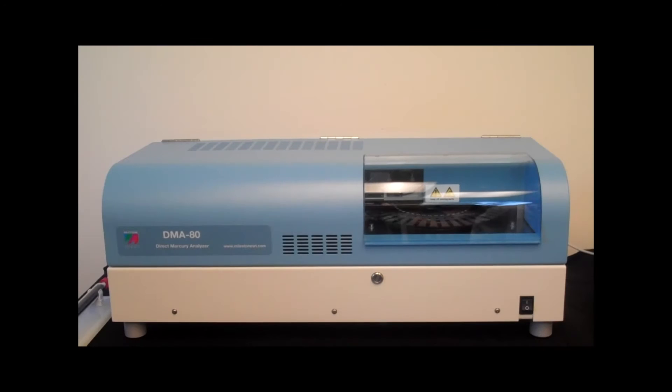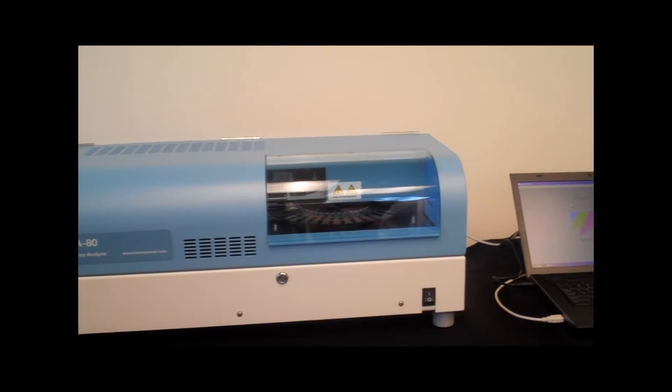Milestone's DMA80 Direct Mercury Analyzer is making mercury analysis simpler than ever before. The DMA80 can be configured with a PC or touchscreen controller and integrated with an analytical balance and printer to form a convenient benchtop package.